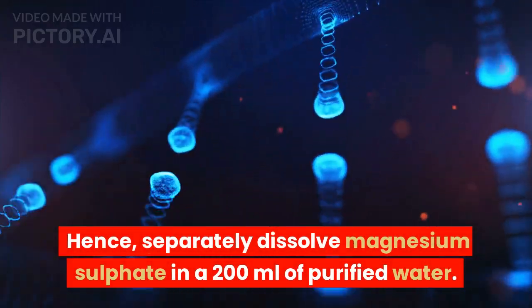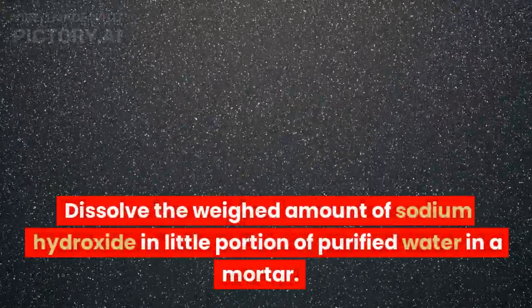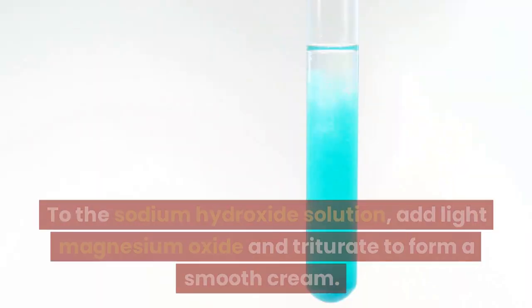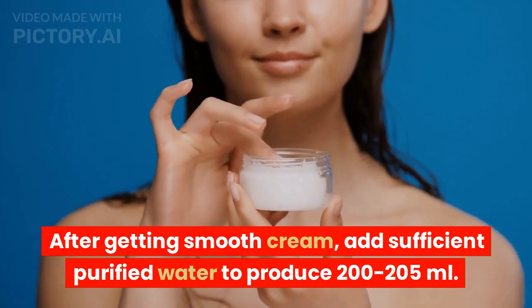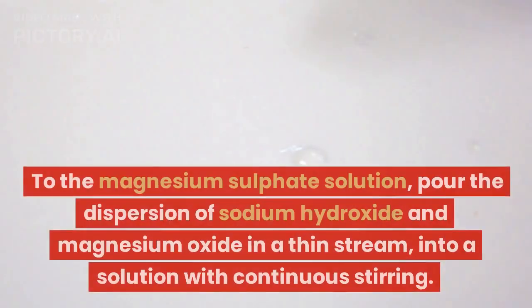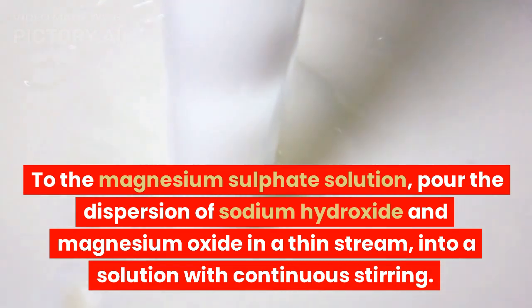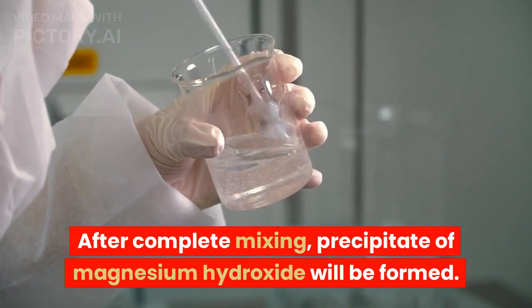Separately dissolve magnesium sulfate in 200 milliliters of purified water. Dissolve the weighed amount of sodium hydroxide in a little portion of purified water in a mortar. To the sodium hydroxide solution, add light magnesium oxide and triturate to form a smooth cream. After getting a smooth cream, add sufficient purified water to produce 200 to 205 milliliters. To the magnesium sulfate solution, pour the dispersion of sodium hydroxide and magnesium oxide in a thin stream, into the solution with continuous stirring. After complete mixing, a precipitate of magnesium hydroxide will be formed.